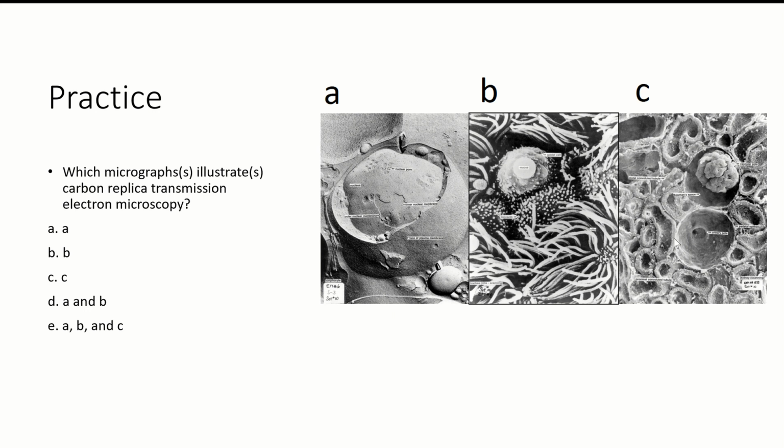B and C are actually going to be scanning electron microscopy, right? So that's the one that looks like you literally scanned in an image, you took a picture or something. So the only one that is going to match is going to be A.